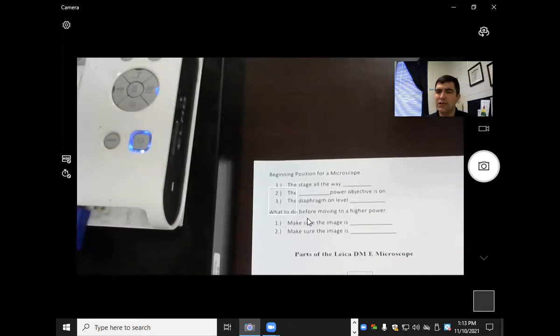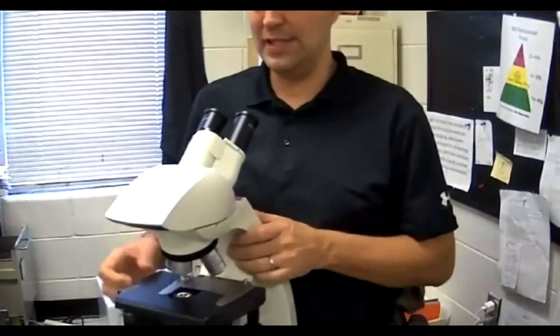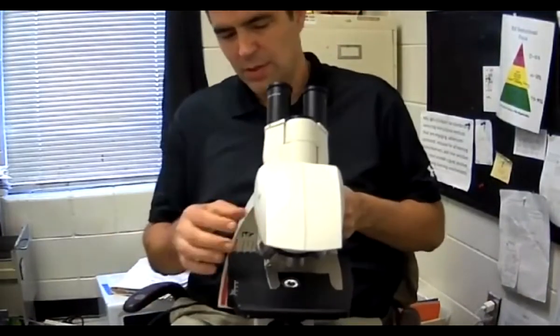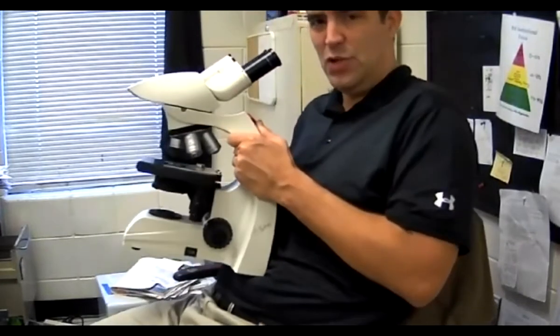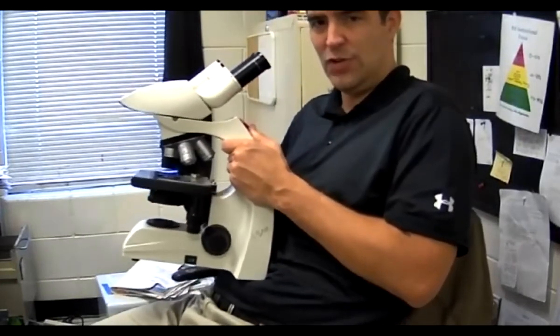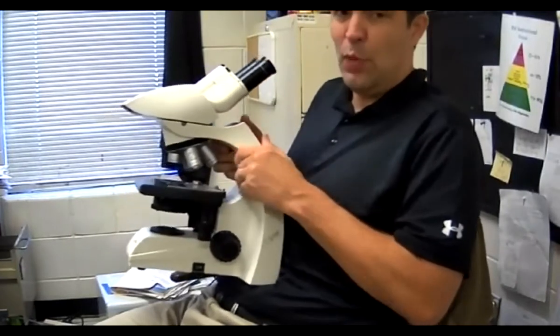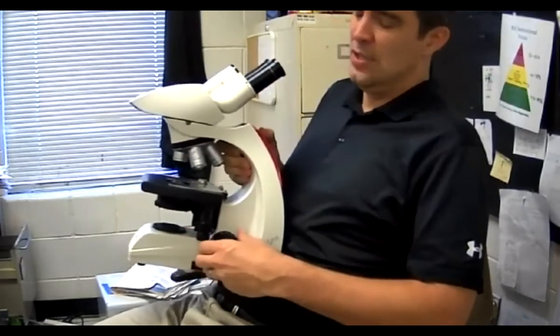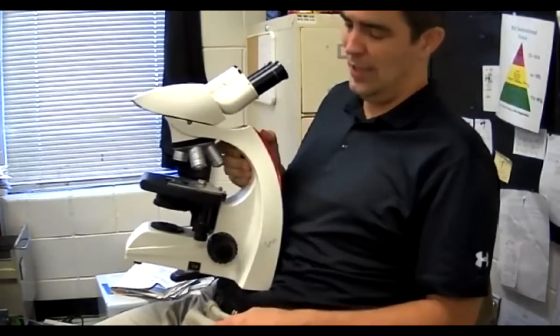When you get your microscope in the beginning position, you're going to take your microscope and put the stage all the way down. You want to turn it so that the stage goes all the way down. The way you do that is by turning the coarse adjustment — that's how you get your microscope ready to use.